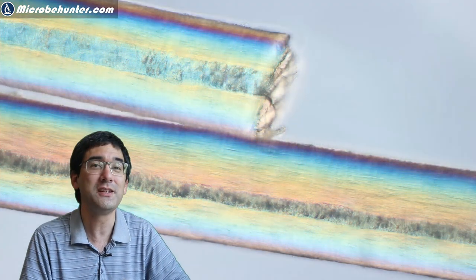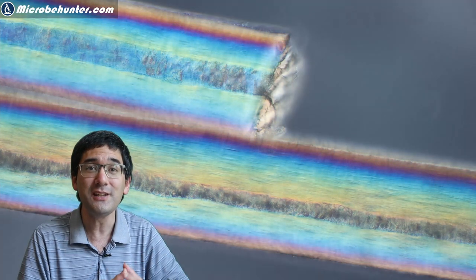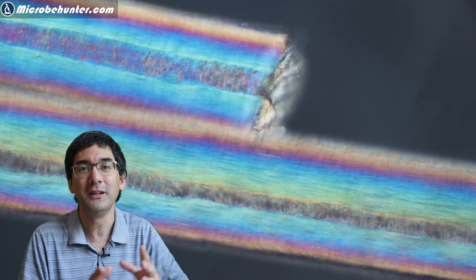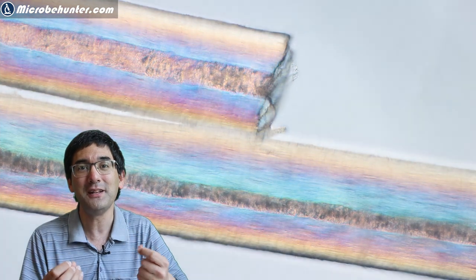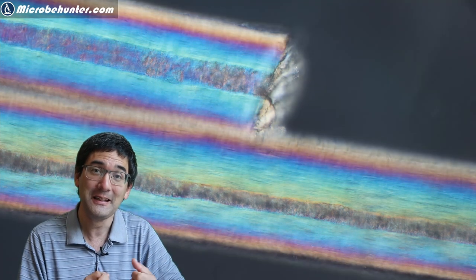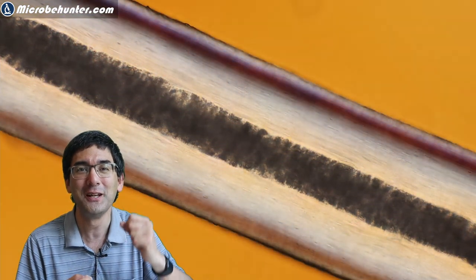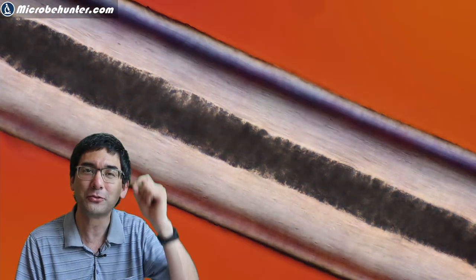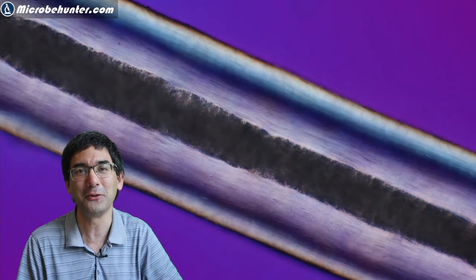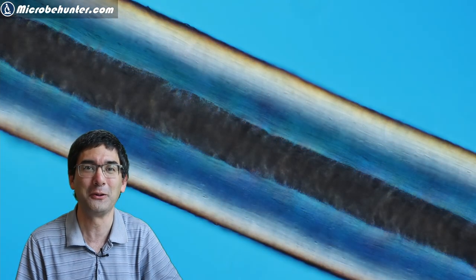Now, hair under the microscope is generally one of the easier specimens to observe. However, because my hair is black and very darkly pigmented, you don't see a lot. So what I had to do is choose those few gray hairs that I'm already starting to grow. I am also becoming older after all.